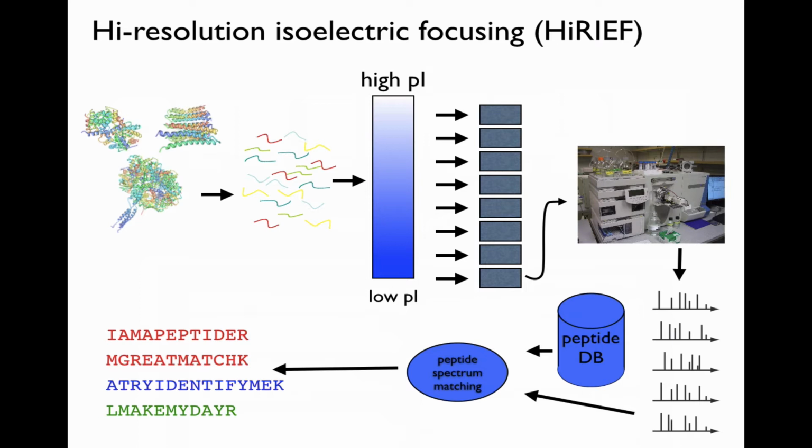Basically, you take your peptide mixture stemming from trypsin digestion, and you separate those peptides based on their isoelectric points. You then have a good pipetting robot that can extract the different pI ranges in a very precise manner. The original experiment was that they searched this against a normal database in order to obtain better PSMs.